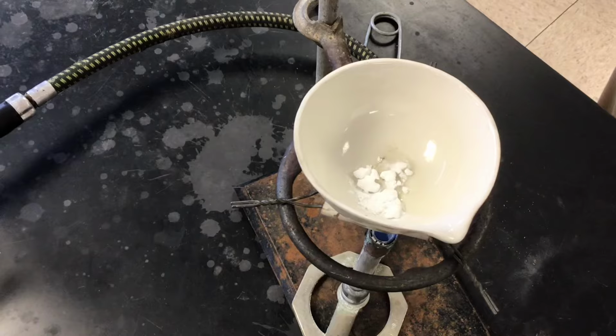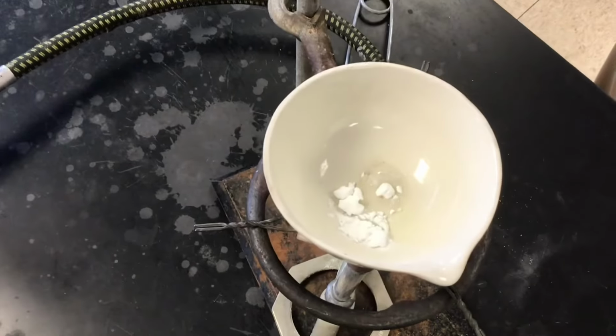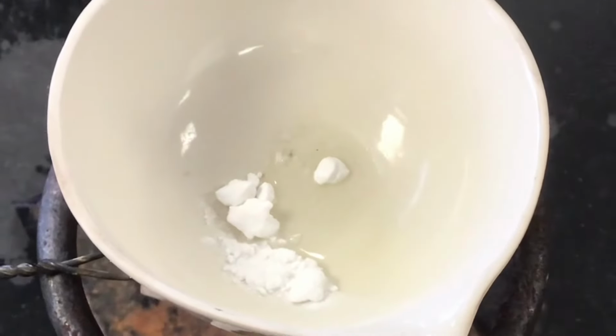Yeah, it kind of gives the look like it's boiling, but it's not boiling. You're right. It's the oxygen that's given off.